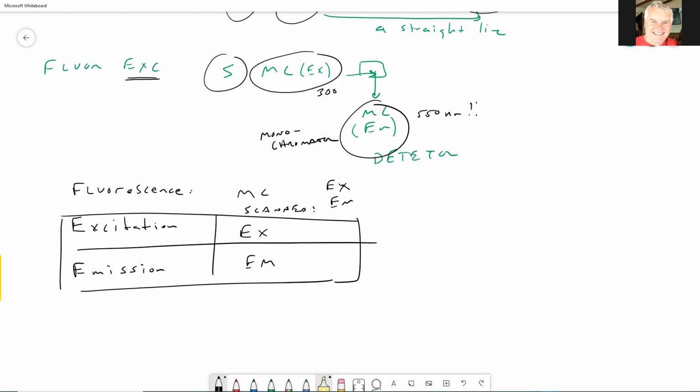And then I'll go over the process of extracting the files from Canvas, and then graphing them, and then filling out the questions. It'll probably only be maybe half an hour tomorrow to finish this up.